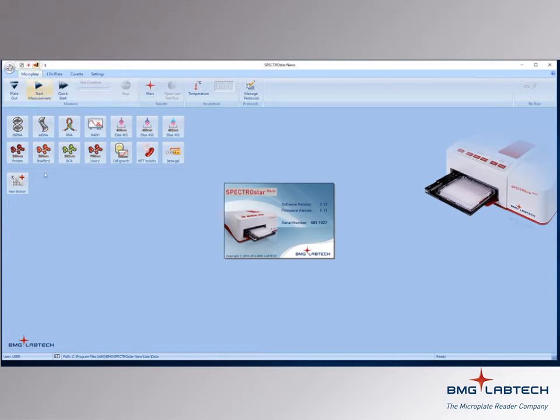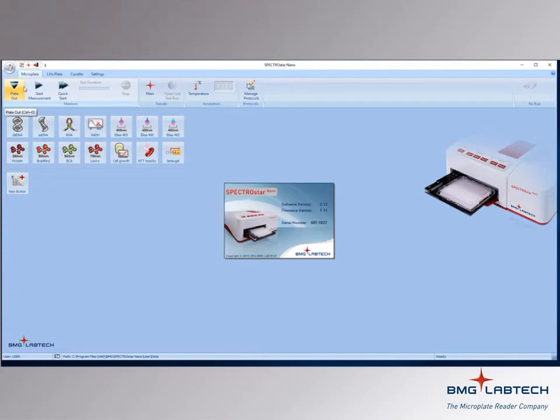If we are within the microplate tab, the functions available while measuring a microplate are shown. These include plate movement, start measurement, and quick start.